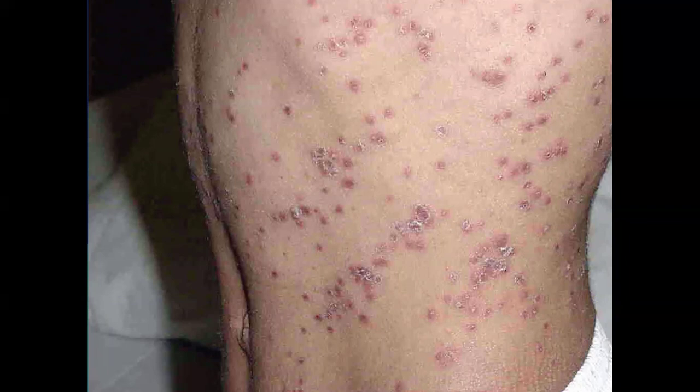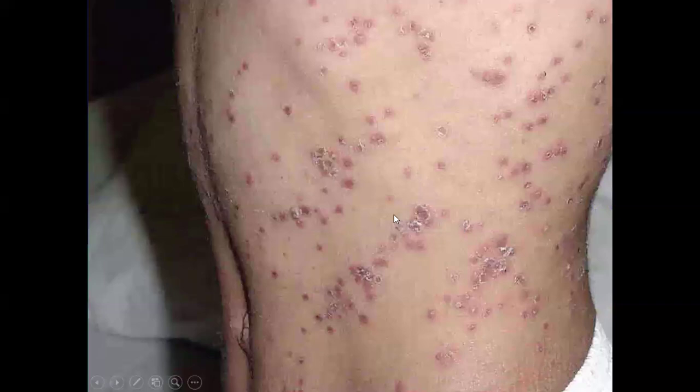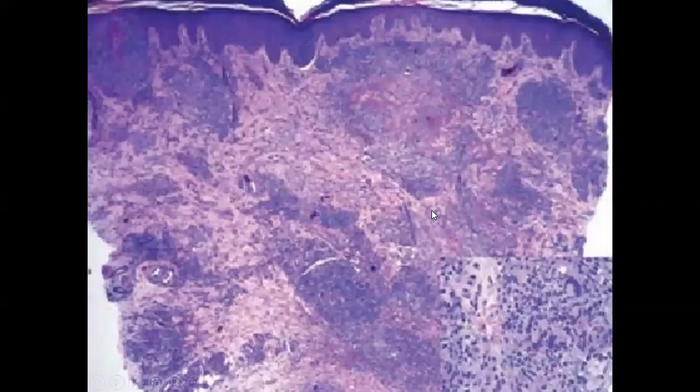Then papulonecrotic lesions are also seen in a form of tuberculid, which is papulonecrotic tuberculosis. In this condition, there will be lots of papules with necrosis. And if we do a biopsy, you would expect granulomatous inflammation within the dermis. Caseation may or may not be seen. There will be giant cells as well, and you can see the Langerhans type giant cell here.